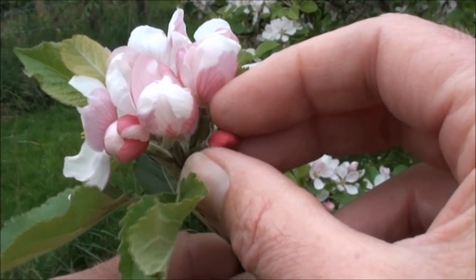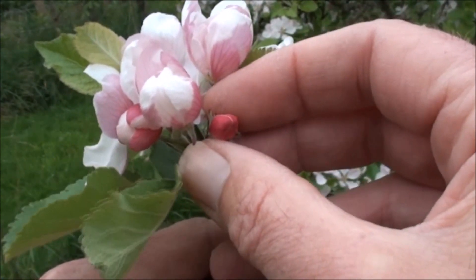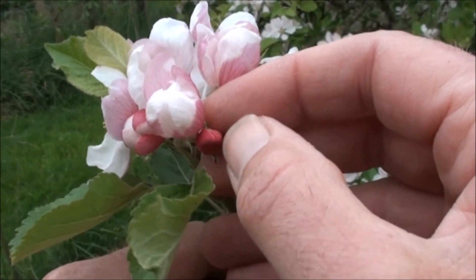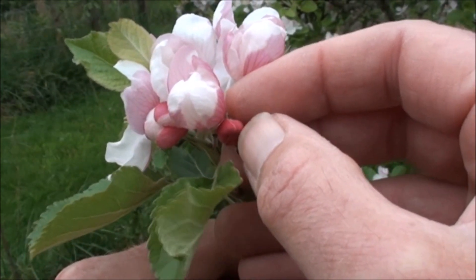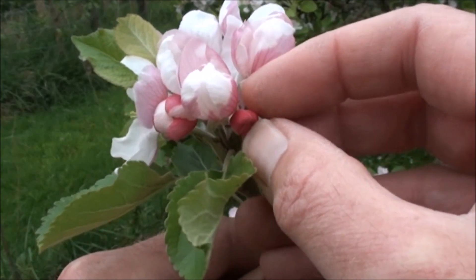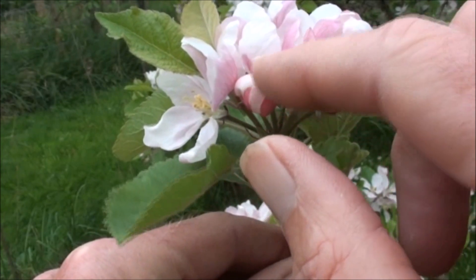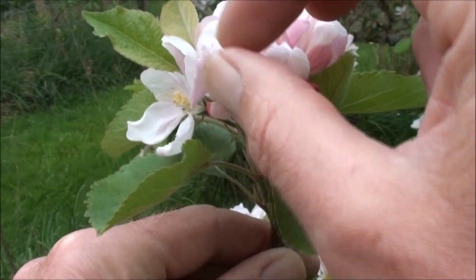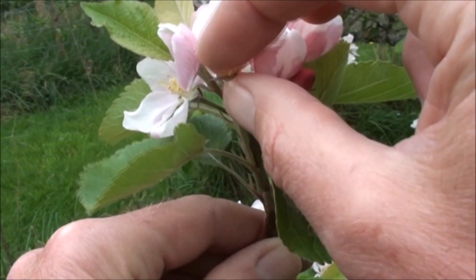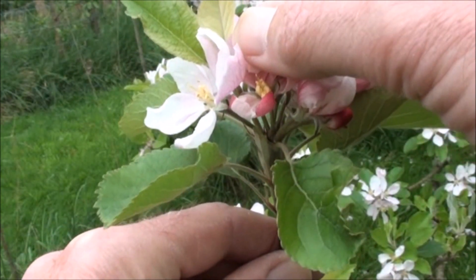Here we've got a flower in a tight early balloon stage. It's too young to be emasculated because it would be difficult to actually get inside the centre of the flower and remove the anthers — they would be very small at this stage. However, this flower is at a later, quite late balloon stage, and could easily be opened and used for emasculation of the centre.